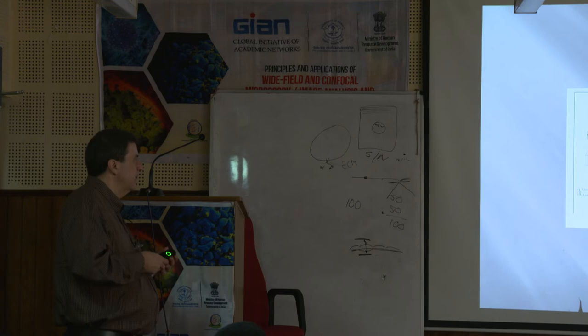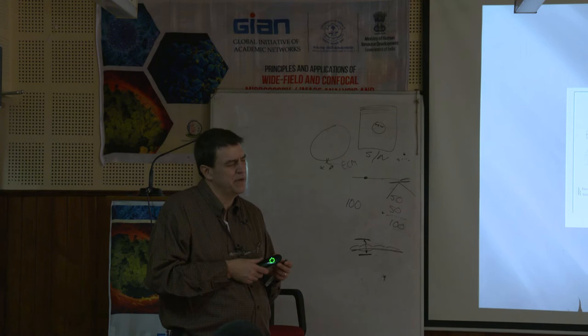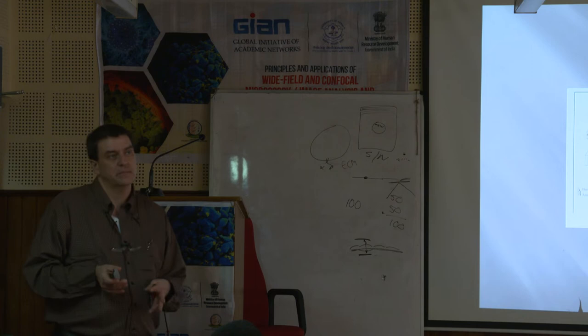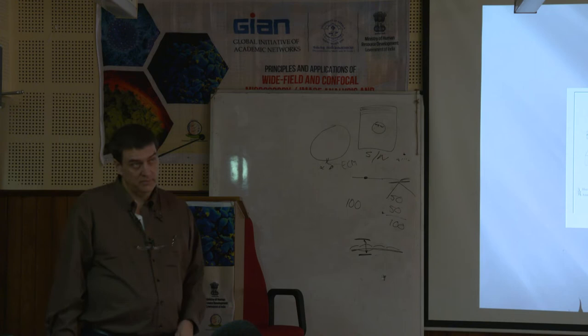It's not the easiest technique. There's actually a man in Virginia, I just can't quite remember his name exactly right now, Amani something, at the University of Virginia. He is like Mr. FRET. He pretty much came up with the technique and runs a big workshop on it. It's not the easiest thing in the world to do, but if it's something you have to do, it'd definitely be worth going to his workshop for a week if you're going to do it a lot.